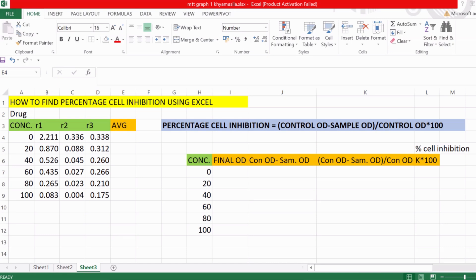Here you can see the drug concentrations used for the experiment: 20, 40, 60, 80, and 100, along with their OD values. We have replica 1, replica 2, and replica 3. In order to get an average estimated value, you need to repeat your experiment at least three times. Here we have repeated the experiment three times and the OD values are as shown.